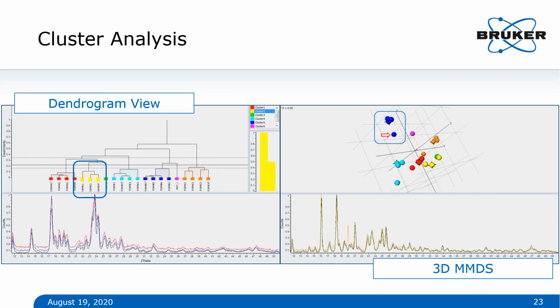On the right-hand side, we actually see these broken down into a three-dimensional cluster. There are XYZ coordinates that can be moved. You can zoom in, you can zoom out, you can turn that clustering around to help out with visibility. And now we're going to look at the blue cluster.